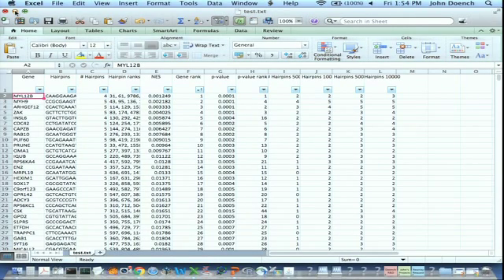So this might seem a little convoluted, but again, the reason is that this is not particularly what GSEA was designed to do, to take gene lists from hairpin screens and get enrichment. Because of that, the hack means that practically your hits have to be the highest number. So we want the exact opposite of this gene rank. GSEA would look at MYL12B and say this is the worst gene in the screen, put it at the bottom of the list. It's pre-baked that your hits have to be high and your non-hits have to be low. So there are a lot of ways to do that.